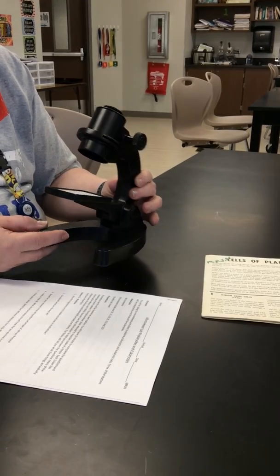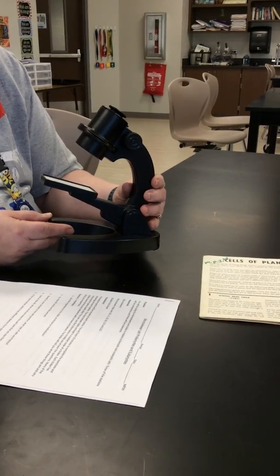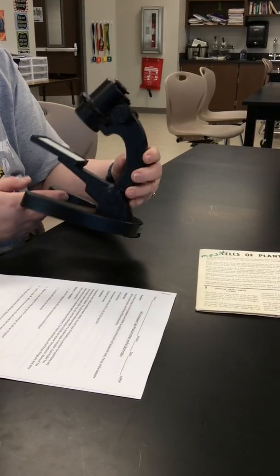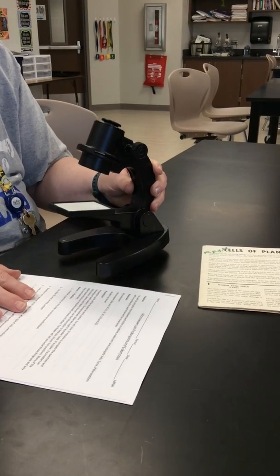Micro as in tiny — they're kind of a low-tech version of a microscope. We like them because they're lightweight, they're easy to move around, they're easy to adjust, and there's no cords to worry about, so we can work with them just about anywhere.